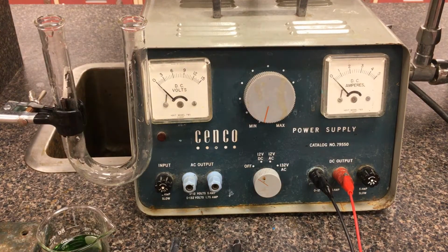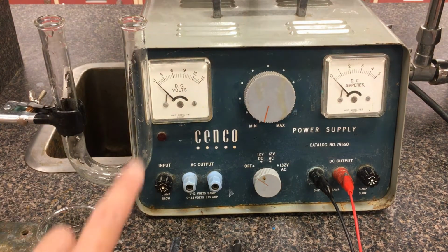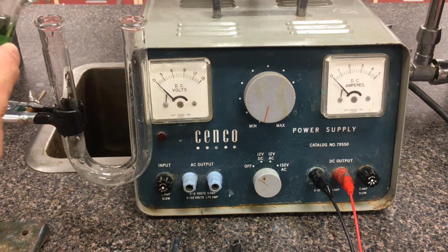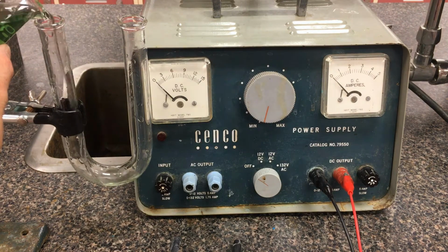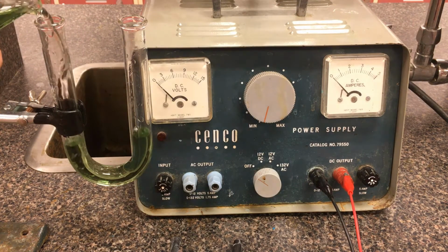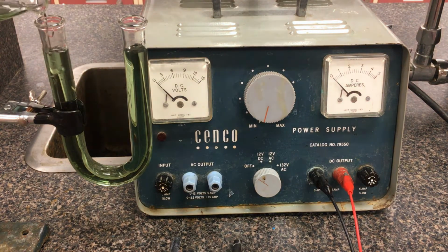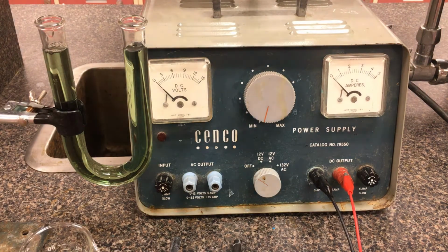I'm going to pour this solution, about 60 milliliters, into this U-tube. The U-tube just helps me separate the electrodes, to make sure that no sparks jump across the electrodes. But technically this can be done all in one container. So I'm just going to fill up this U-tube. Again, this green color would be the end point, the transition point. It's a roughly neutral pH.